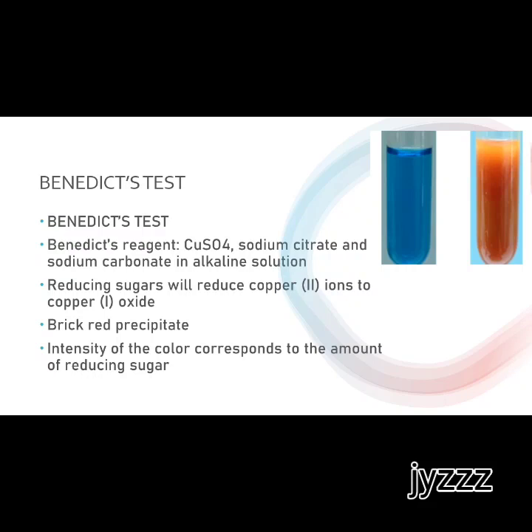Accordingly, the intensity of the color corresponds to the amount of reducing sugar present in the solution.